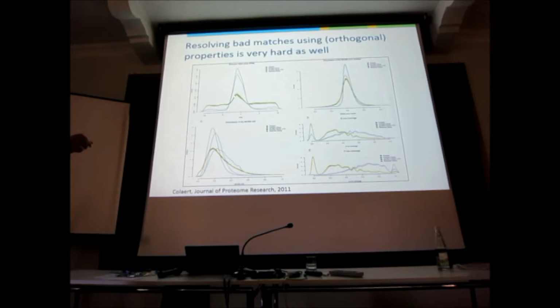You see the original decoys here, and you can see that the ppm mass error is indeed much bigger for most of these traditional decoy hits. So we can learn something from this. We can learn about the decoys. But now look at our directed decoys, the Photoshop guys. There is a difference, but it's minimal.